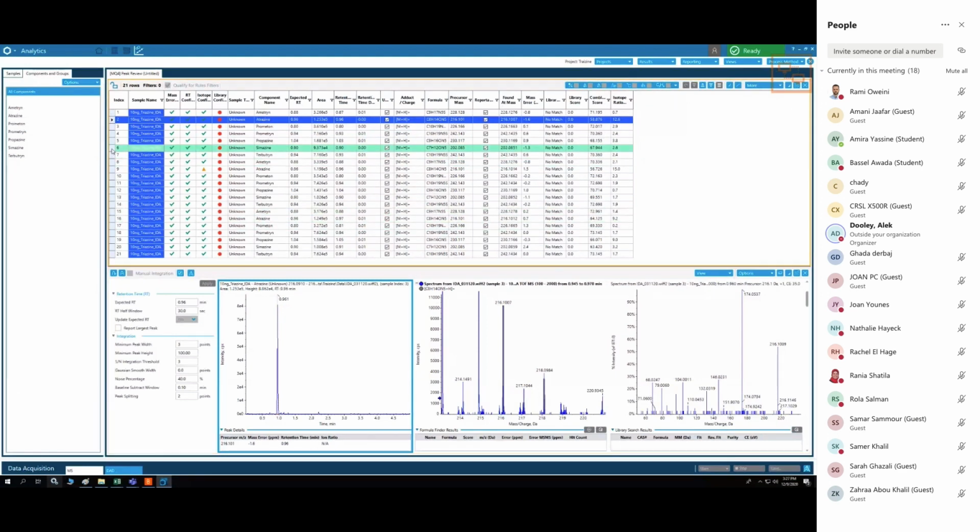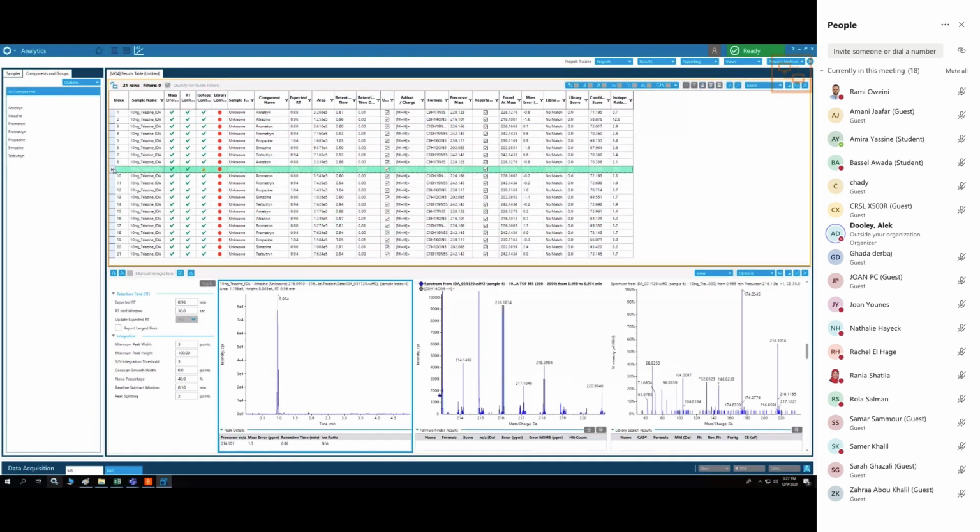And whichever one you click in the table, it will show you that data from that line. So now you know how to sort your table, you can quickly do that and find which ones you want to look at, and then you can go through them one by one and actually look at the data down below. So first of all, we have a lot of red marks, which for libraries, so we need to investigate why we have that. But the good thing is the mass error and the retention times are all good.